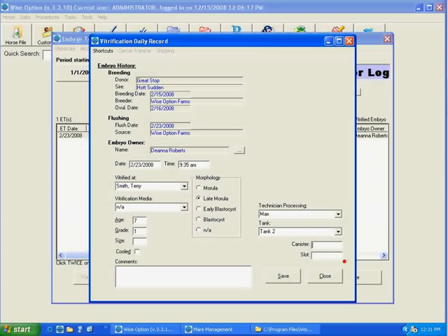The canister is going to be 2 slot. We don't use it, or you could put slot 3 or whatever information. It's an alphanumerical field, so you can enter labels or other additional information you want to put. If you have some sort of permission serial number, you can put it here and in a comment area, which is in this case up to 150 characters, and you can make it multiple lines. I'm going to save this.